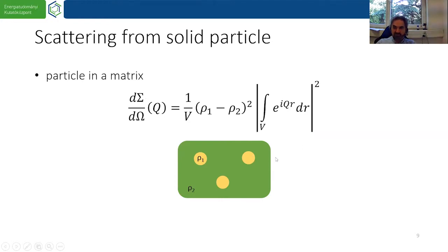You know, micelle is a small sphere composed of surfactant molecules. Normally they are fluid, so these spheres are not exactly spheres, but they are fluctuating or undulating spheres. But the average is usually either a sphere or an ellipsoid or a cylinder.